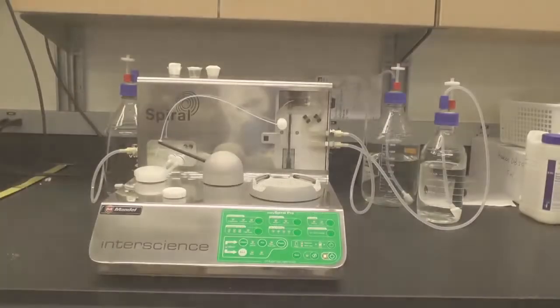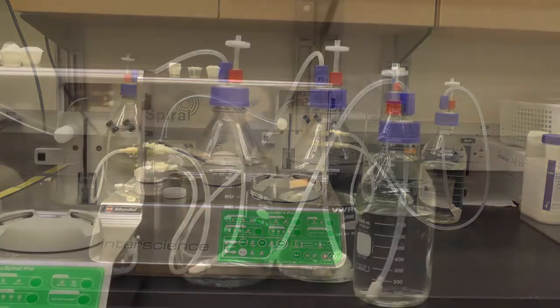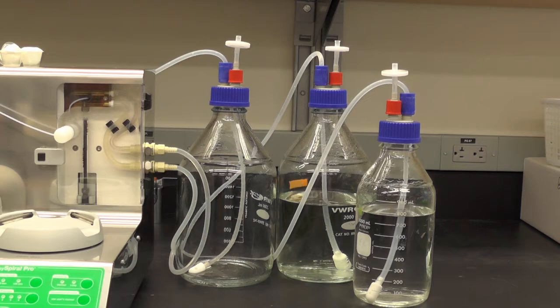In this video you will learn how to use an automatic spiral plater, the easySpiral automatic spiral plater. There are three bottles attached to this instrument including a disinfectant bottle, a sterile DD water bottle, and a waste bottle.